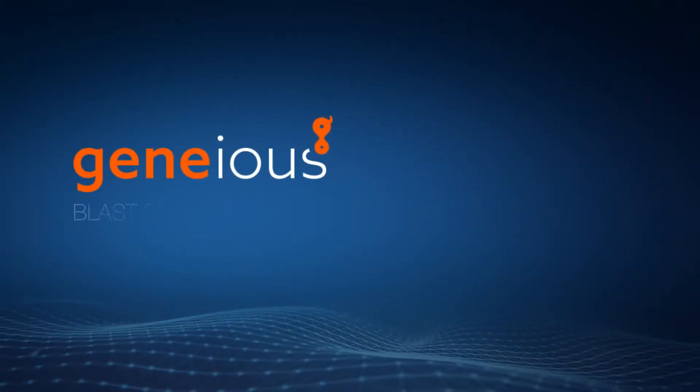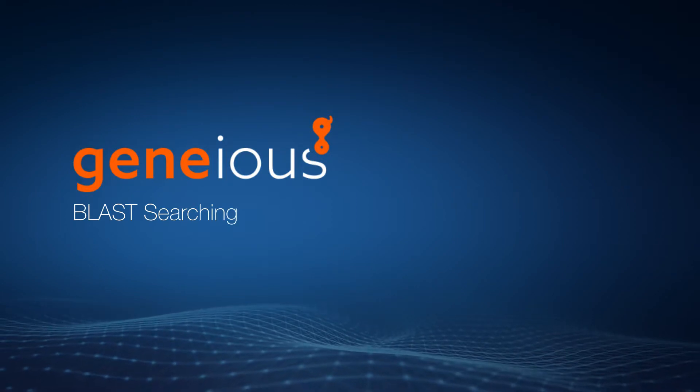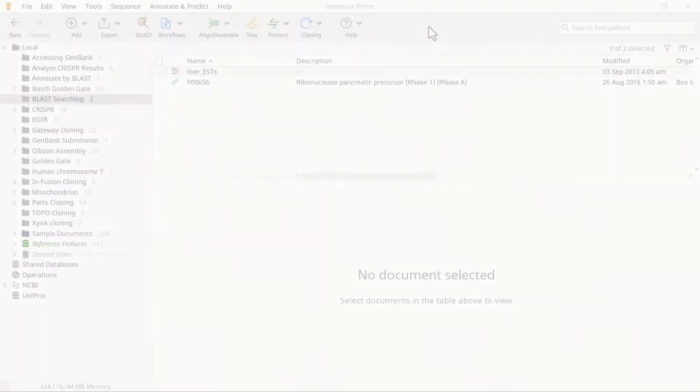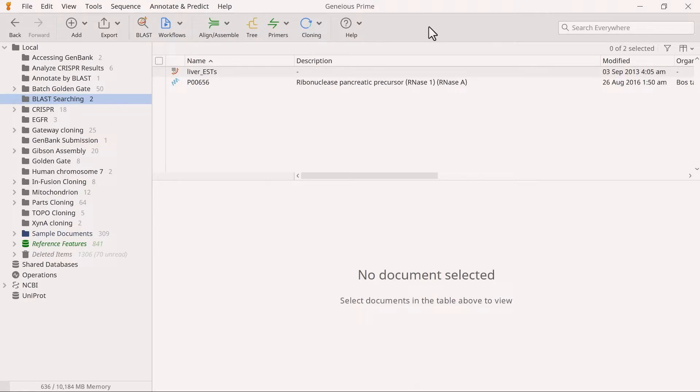Welcome to this video on BLAST searching in Genius Prime. The Basic Local Alignment Search Tool, or BLAST for short, finds regions of local similarity between nucleotide or protein sequences by comparing your sequence of interest with NCBI databases or a custom database created from your own sequences.